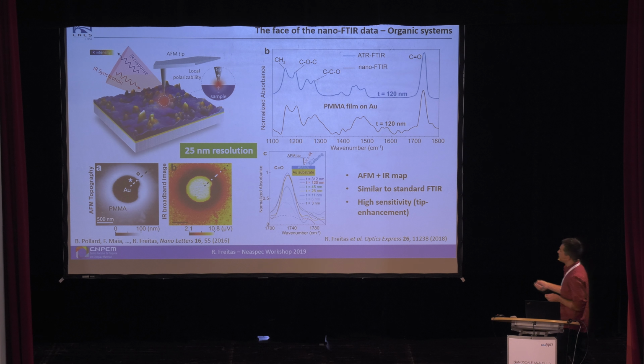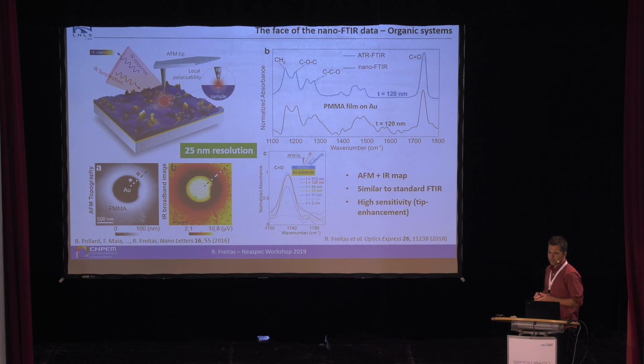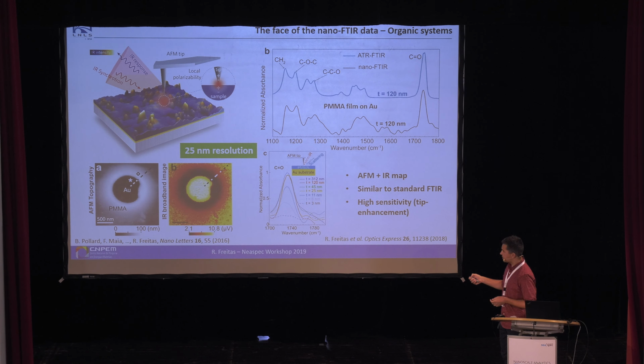But something that we try to learn here is actually how the sensitivity of the technique is using synchrotron. So we started analyzing films from some hundreds of nanometers down to 3 nanometers thick. And we could see that we could identify the carbonyl peak down to 6 nanometers, which is pretty cool. As we know where the peak should come, being very positive, there is something here for the 3 nanometers, but it's already fantastic to see this sensitivity with a very low power source.